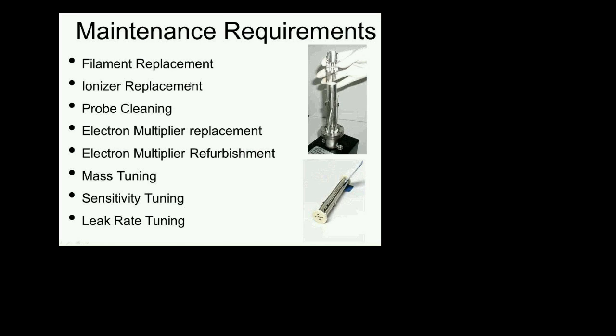In terms of filament and ionizer replacement, make sure when you buy an RGA, like you can see right here, that the ionizer is field replaceable. There's no reason in this modern age that you have to send the unit back for refurbishment. It's costly, it causes a lot of delays, and there is just no reason why you couldn't make a design where the user can replace it on their own.